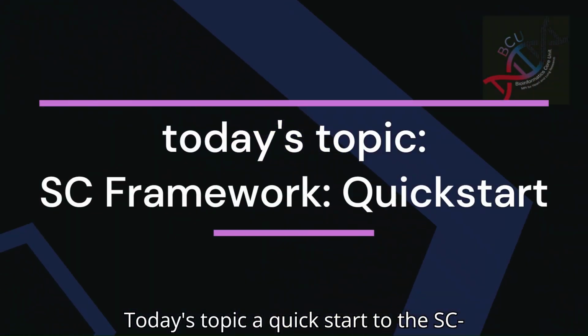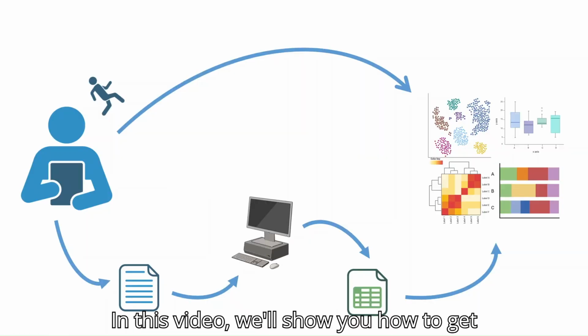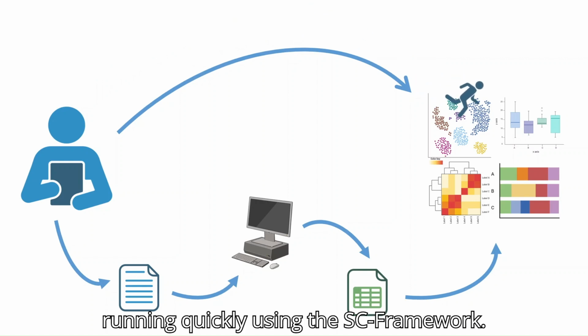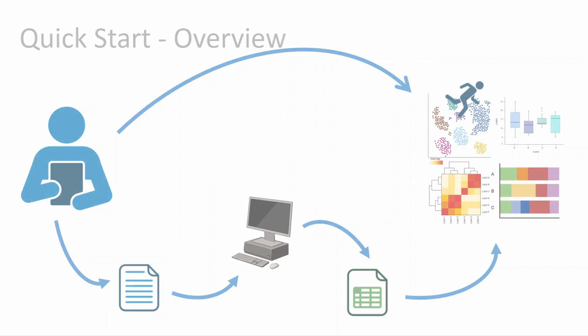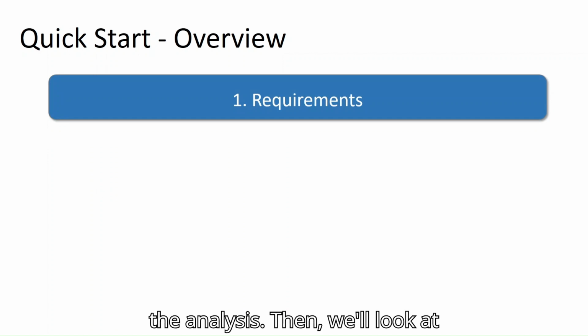Today's topic, a quick start to the SC framework. In this video, we'll show you how to get your first single-cell analysis up and running quickly using the SC framework. First, we'll run through the things you need to have installed before you start the analysis.